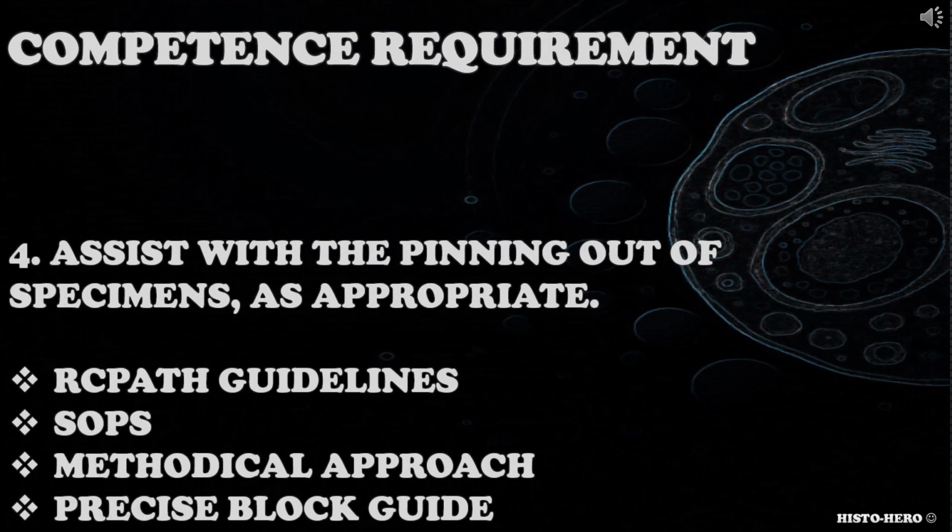The fourth competence requirement is for you to assist with the pinning out of specimens, as appropriate. Some samples are usually received to the laboratory already pinned out. So, you might not be able to assist with the pinning out of the specimens. However, you might be able to assist when the dissection of pinned out sample is performed in the laboratory.